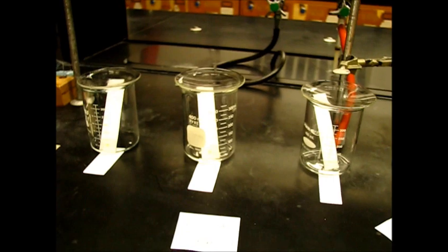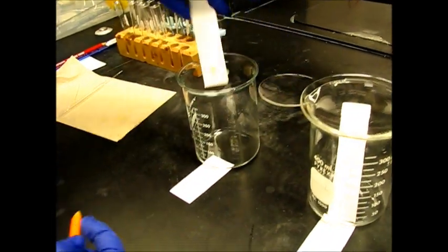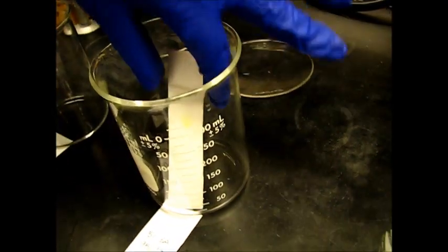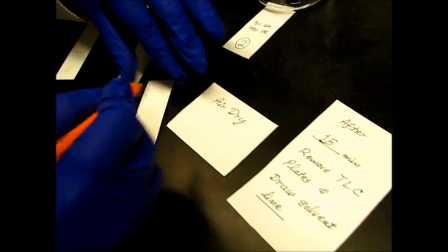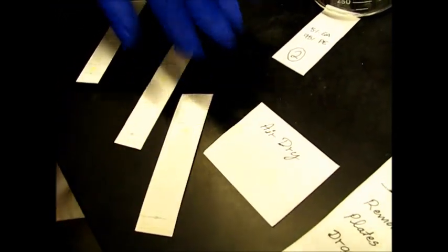And then we're going to run it for 10 to 15 minutes. After 15 minutes, we have to remove our TLC plate and draw our solvent line. We're going to gently remove it and immediately mark our solvent line before it evaporates. It evaporates really quickly. Same thing with the second one. We immediately draw the solvent line. And then we let them air dry, which will be pretty fast.